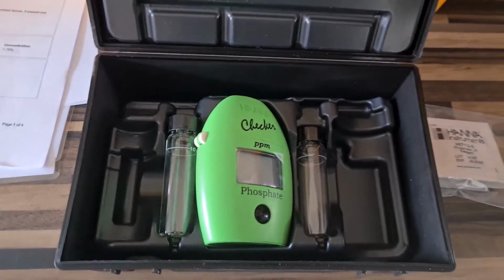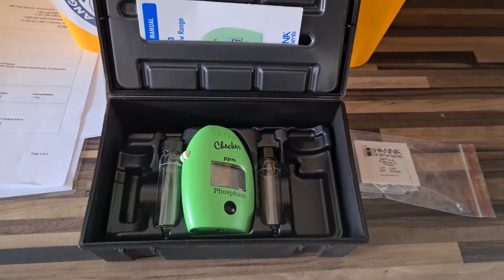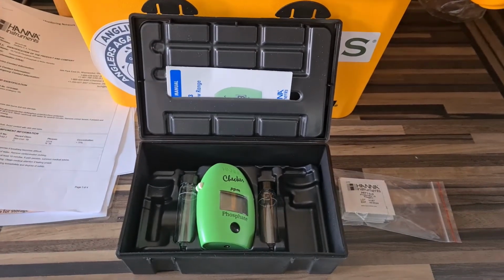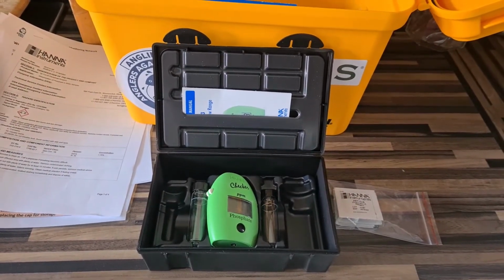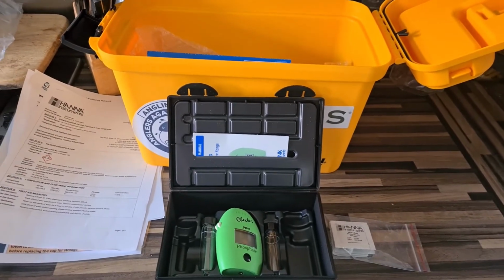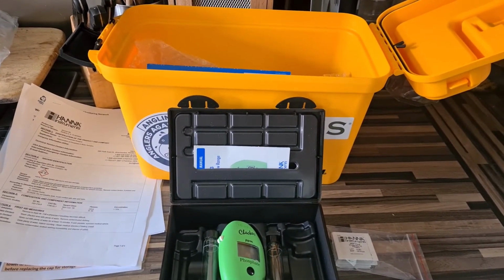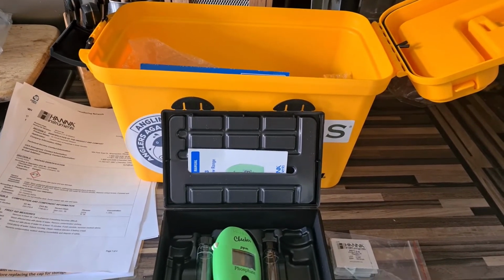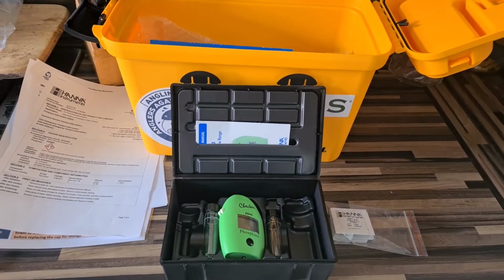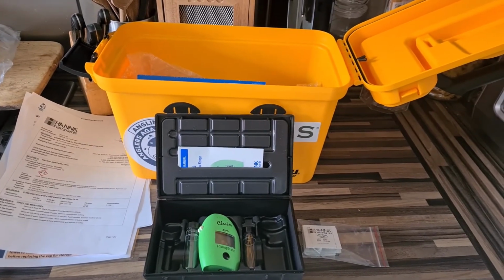Okay, hopefully it's not a bad kit for the initial cost. I believe the consumables like the reagents and the test strips come to about 30 quid for another 25 tests. So depending on how many tests you do, depending on how many you go through. Okay, hopefully it's just giving people an idea. It will be good for your clubs and everything to get those to monitor the water quality and submit the data. Incidentally, that's done via the website of EpiCollect 5, and there's an app that you can download onto your smartphone to submit the data online. Okay, hopefully we'll get some more clubs on board with that, and we'll see what the data brings.